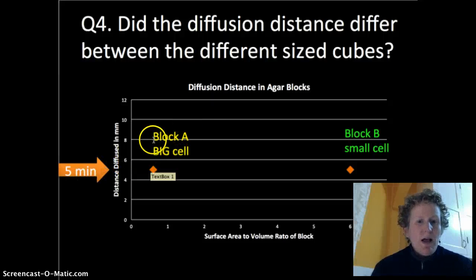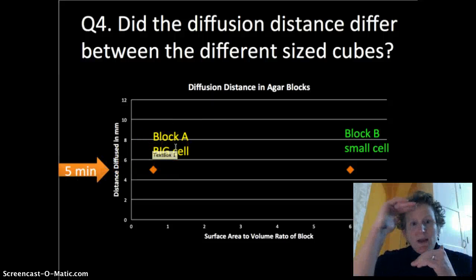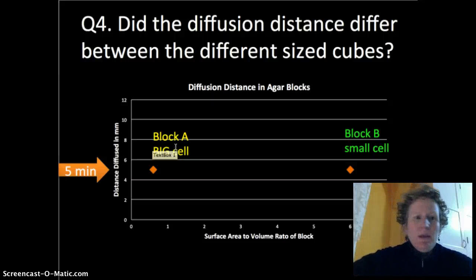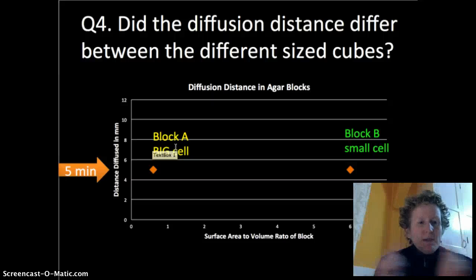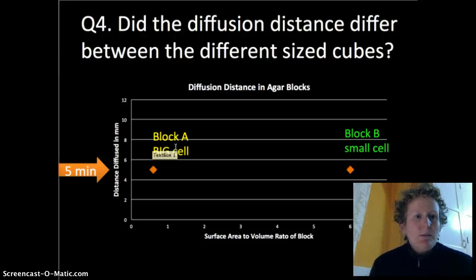So here's block A, the really big cell, and here's block B, a really little cell. The distance the vinegar diffused is going to be the same because the cell size doesn't control how fast the vinegar diffuses.